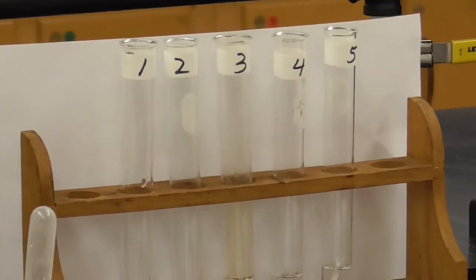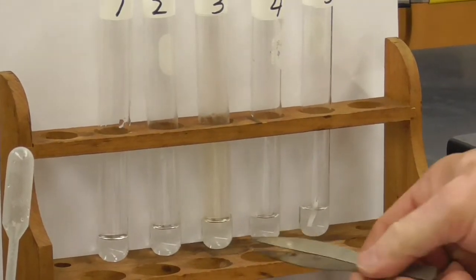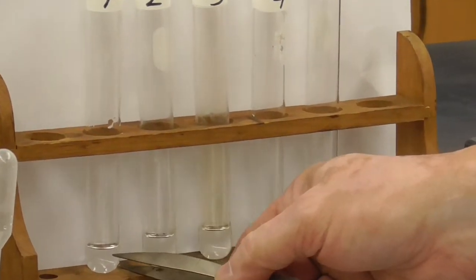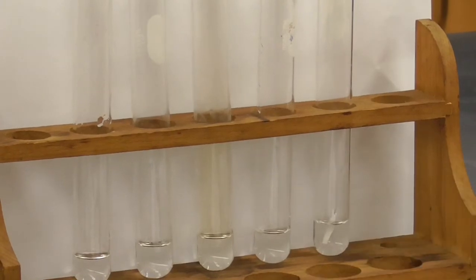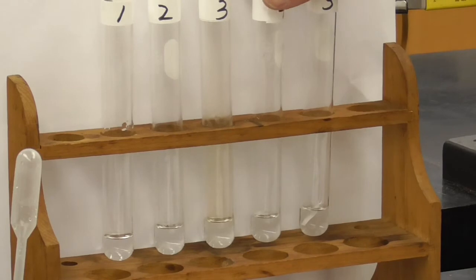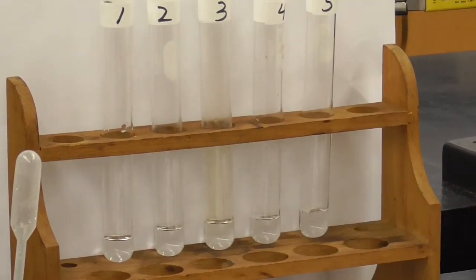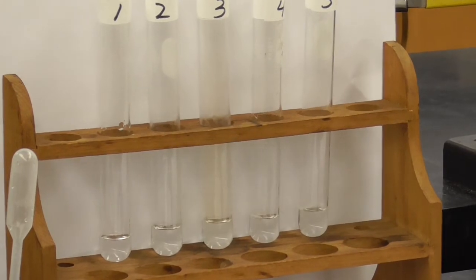If the metal is totally gone, clearly it's reacted. So far it looks like no metal left, no metal left, no metal left here, but these 2 are still reacting a little bit. They still have the metal present. This one's almost gone though. This one's still bubbling. So we'll keep watching for a little longer.